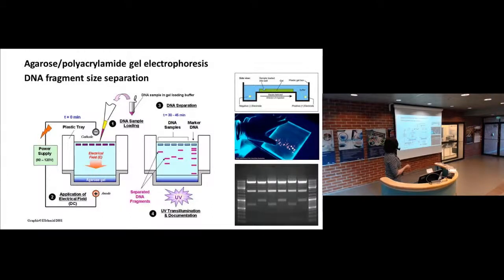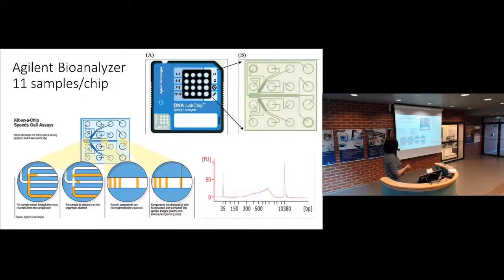So for high throughput, and if we want to quantify very accurately and see the size very accurately of different bands or smears, we often use bioanalyzers.